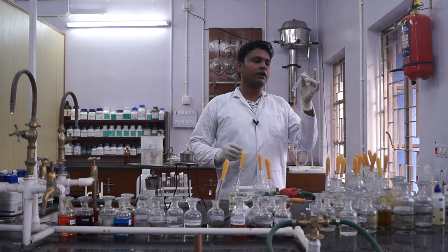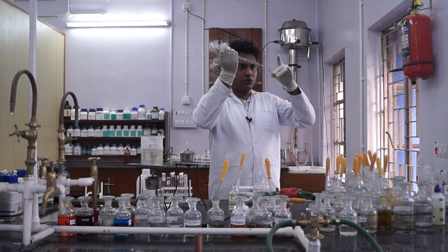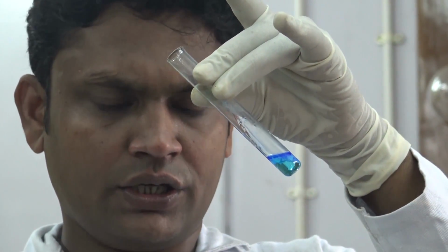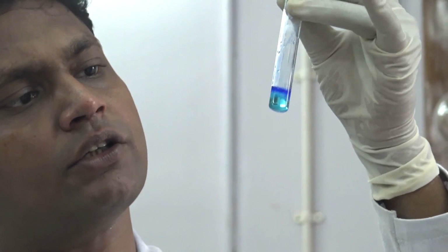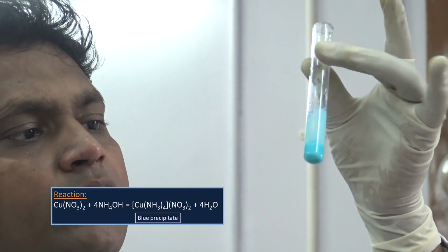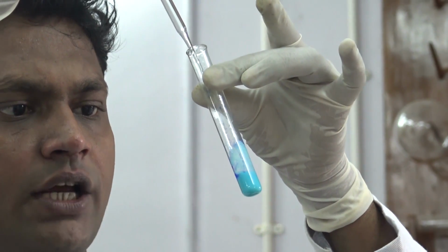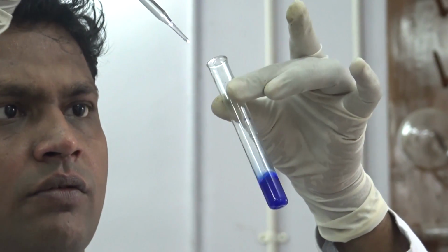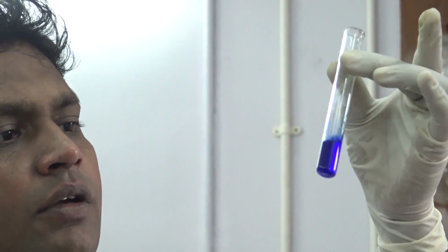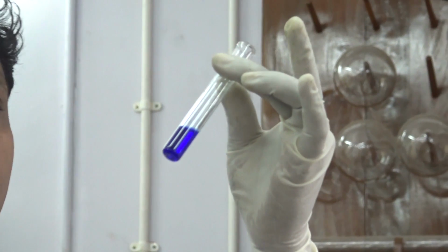For the first test, that is the ammonium hydroxide test, we have to take the first sample solution and add 1 or 2 drops of ammonium hydroxide into it. Here we can see that pale blue precipitation occurs. After addition of excess ammonium hydroxide, the pale blue precipitation turns to a clear blue solution after dissolving in it. It confirms the presence of copper ion in our solution.